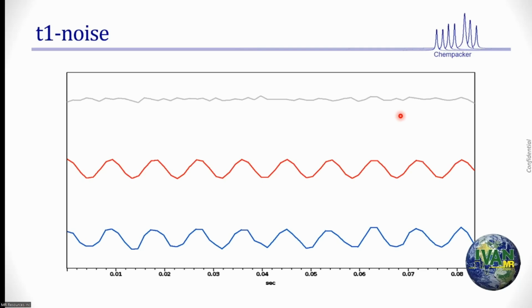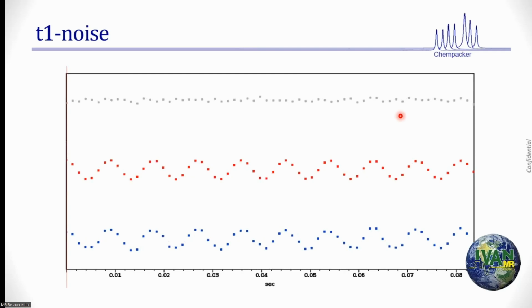So when I say noise, what we really mean is that there is nothing physical. It is about how certain you are in the time domain data points. How certain you are. So noise is nothing but uncertainty in the signal detection. That's the definition. Uncertainty in the signal detection. The very moment I say that, the detection method makes a difference. Depending upon your detection method, the same data may give you a higher uncertainty in one method and less uncertainty in another method. So the very definition of noise now means, how are you detecting the signal? In this case, how am I detecting the frequency? How am I detecting that oscillating sinusoid in there?